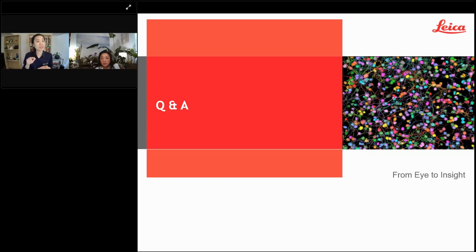That also comes with lineage tracing too. So you can see when the cells divide, there are markers to see when that division happens. And there's also a chart functionality that comes with it to see both the parent and the daughter when that division happens. So there's some capabilities there.